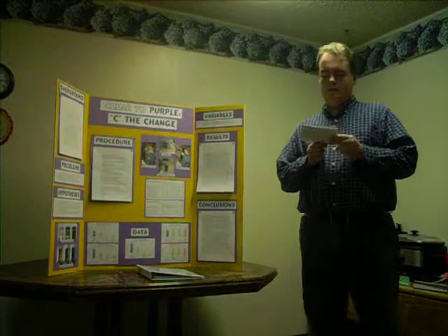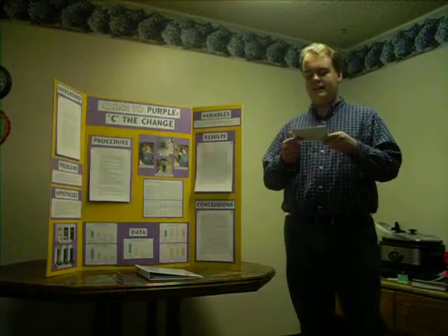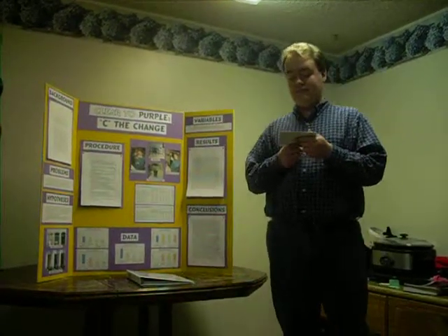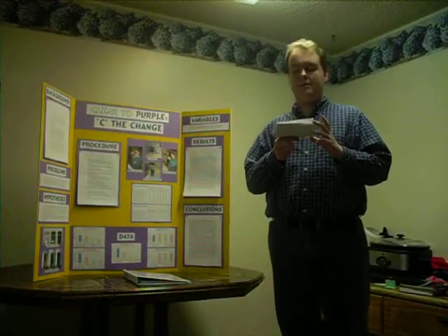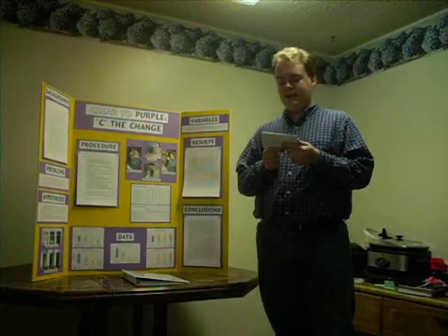My conclusion for the first experiment is as follows. The iodine did have the most speed, which supports my hypothesis, although as it got higher and higher, it glitched up the experiment more and more. The second most speed was the temperature. That did not support my hypothesis. I had hypothesized that hydrogen peroxide would be the second most effective. The third most effective one was the hydrogen peroxide.